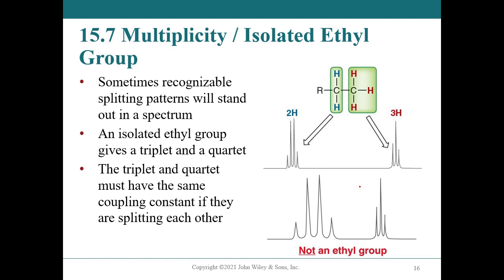Yes? Does that mean that the quartet is not a quartet but a doublet? No, it's still a quartet, but it's being split by something else. There's more to this molecule than this R. It's being split by something other than the groups that are being shown there.